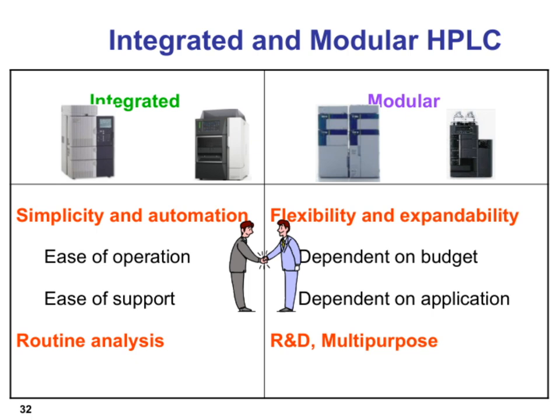Overall, choosing between integrated and modular HPLC depends on your specific requirements, whether you prioritize simplicity and automation for routine tasks, or flexibility and expandability for more complex or research-focused work. Both approaches have their strengths, and understanding these key points helps us make the best choice for our laboratory.